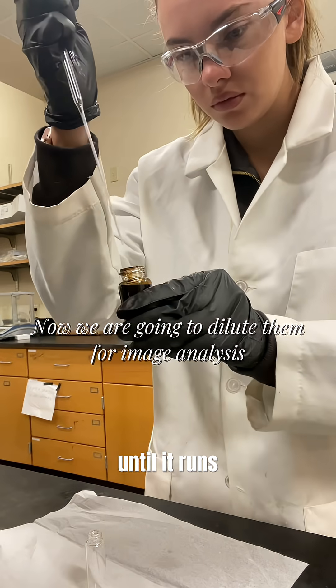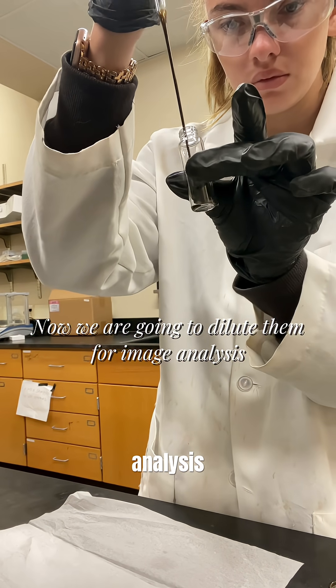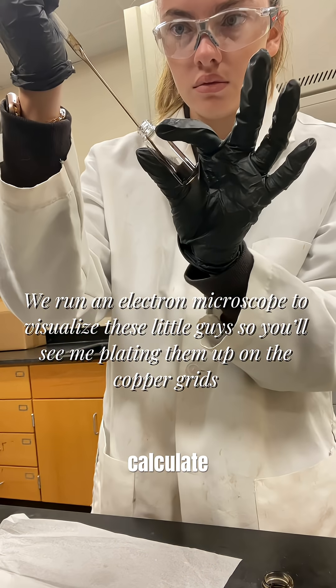We're going to keep doing that until it runs clear and then I'm going to dilute these samples for image analysis. You want the color to be like weak tea so it's not overly concentrated on the image grid. This makes it a lot easier to calculate the images later.